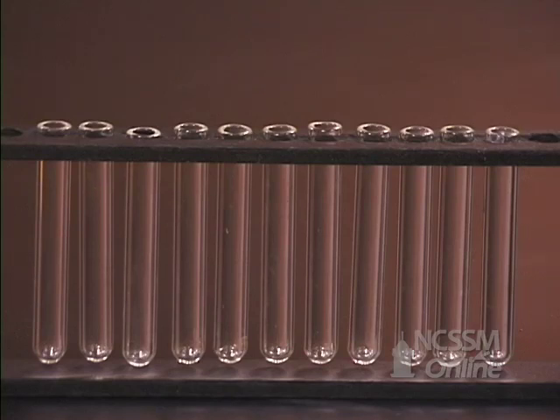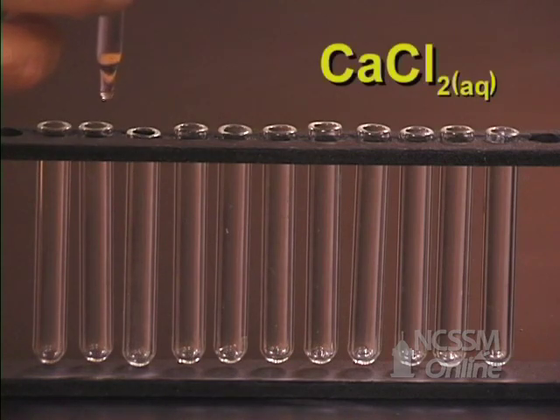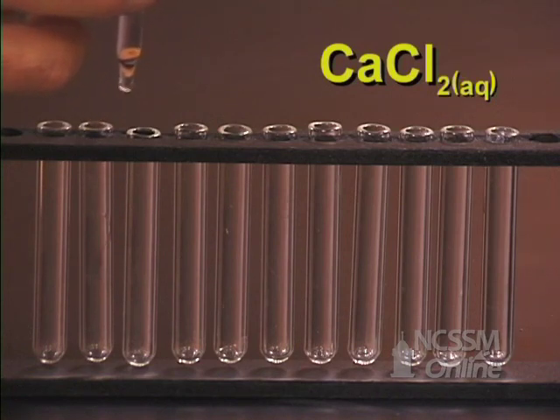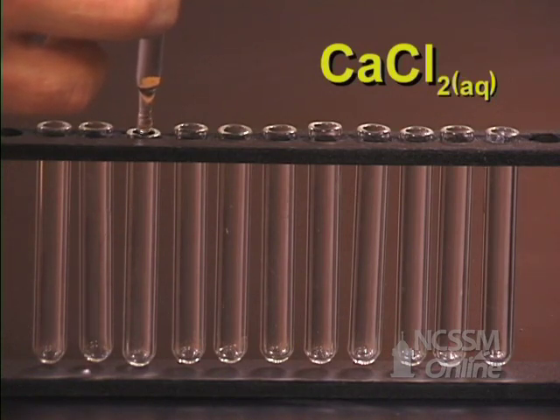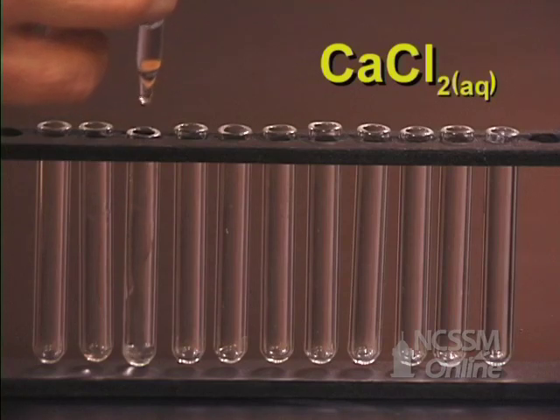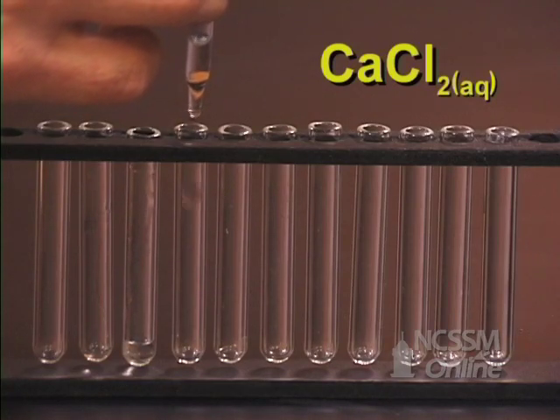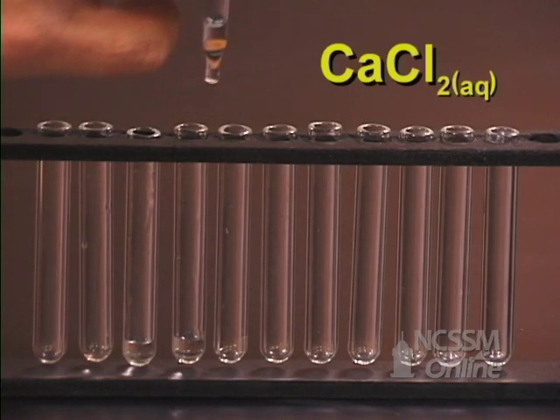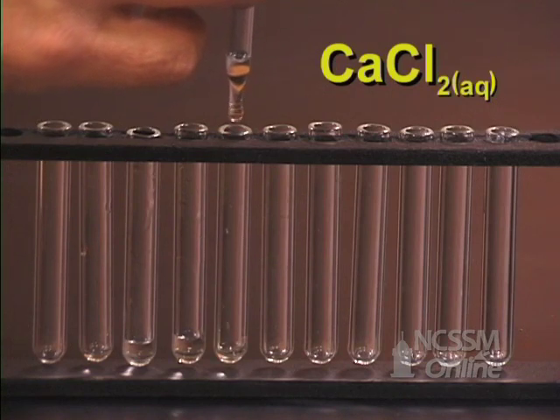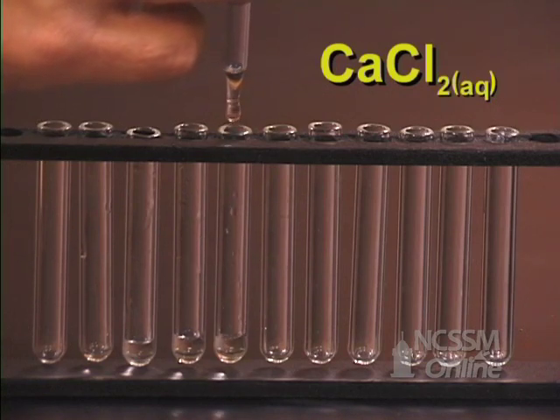We have a series of test tubes. In test tube one, we are going to put zero drops of calcium chloride. In test tube two, we are going to place one drop of calcium chloride. In test tube three, we will place two drops. In test tube four, we will place three drops. In test tube five, four drops, and so on.